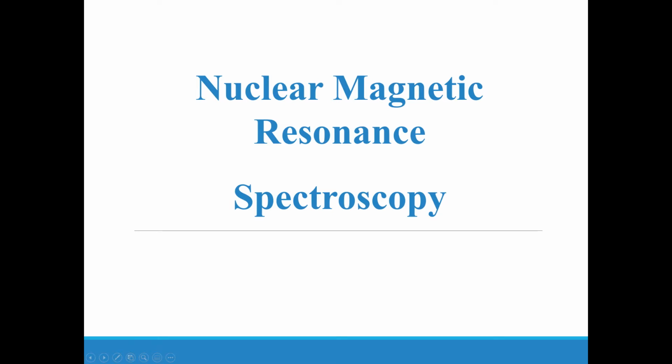Hello everyone, and welcome to the final lecture for the Organic Chemistry Lab. In this lecture, I'm going to be going over nuclear magnetic resonance, or NMR spectroscopy.